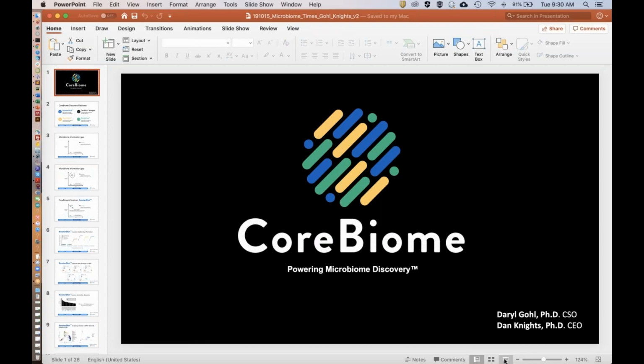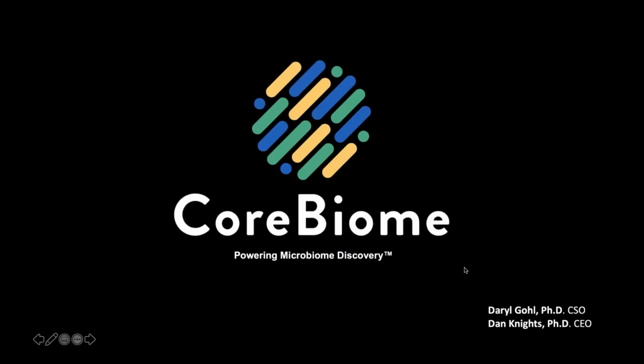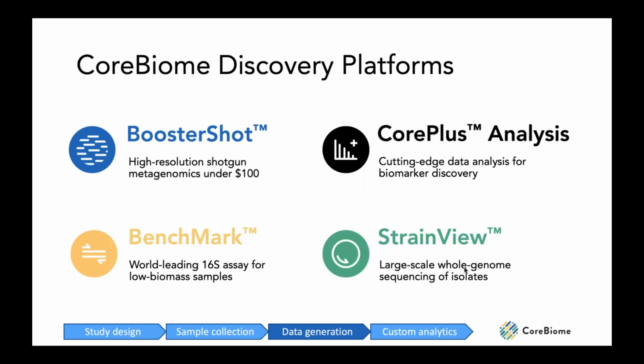Great. So I'm going to tell you today about work that we've been doing at CoreBiome to improve the accuracy, the resolution, and the reproducibility of microbiome data generation. And so I'll be talking about this next phase in the microbiome analysis pipeline, the data generation phase.